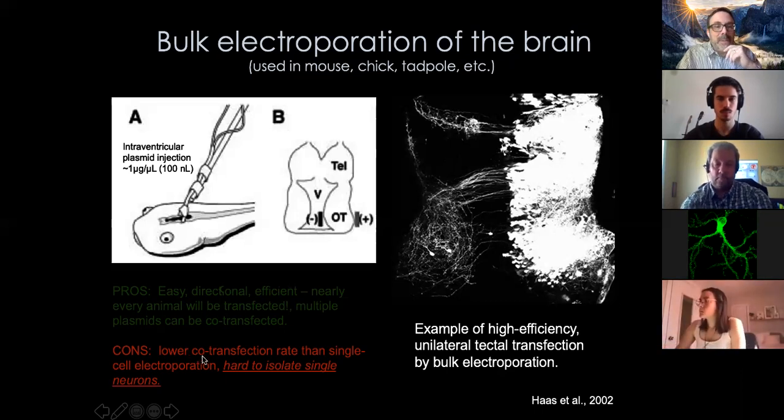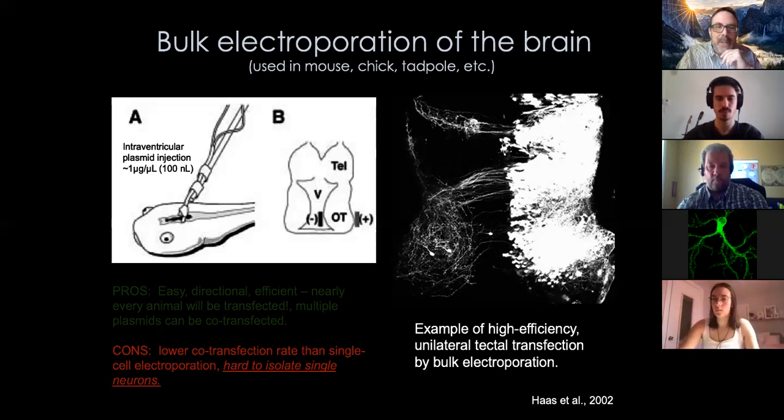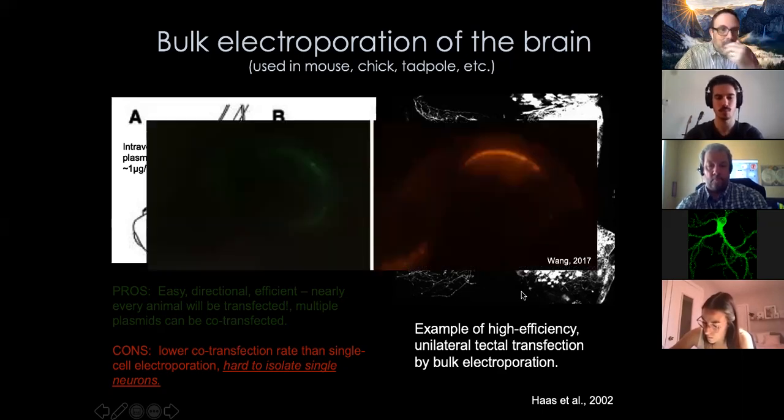The negative, though, is that you've got a little bit lower co-transfection efficiency. It's probably around 85 to 90%, which is still pretty good. But you can't assume that just because a cell has one construct, it has the other, if you wanted to inject two constructs. And of course, getting back to this issue, getting single cells is really where it's problematic here. And this is just an example of hippocampus that had been in utero electroporated.